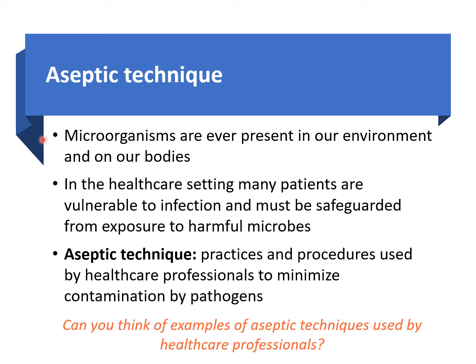Microbes are ubiquitous, meaning they are found everywhere. They are found in our environment, for example, in the air and in the soil. You find microbes on surfaces. They can be on your skin, even inside of us. And so basically, microbes are found everywhere, which creates a challenge when we want to protect ourselves against them.